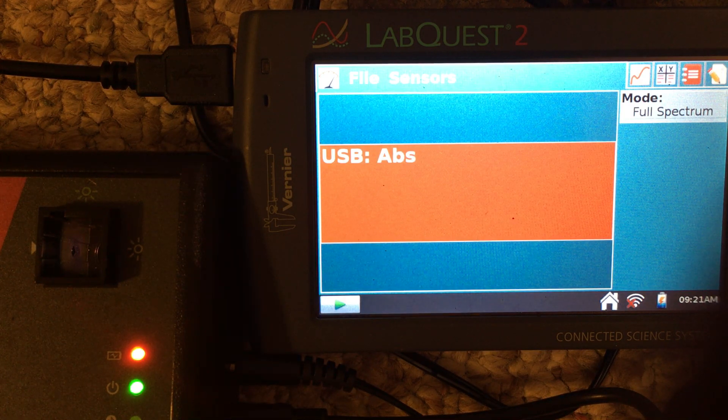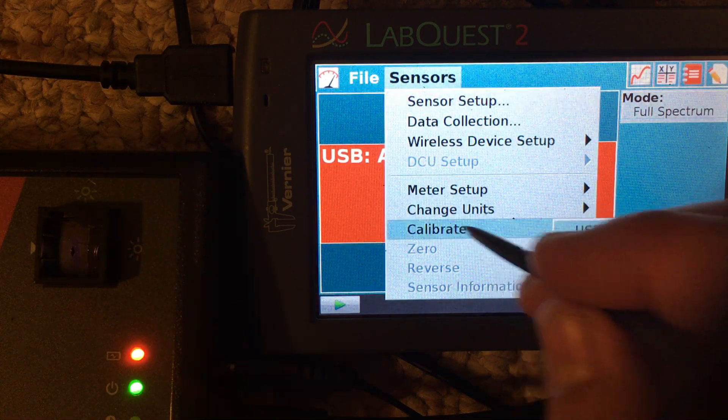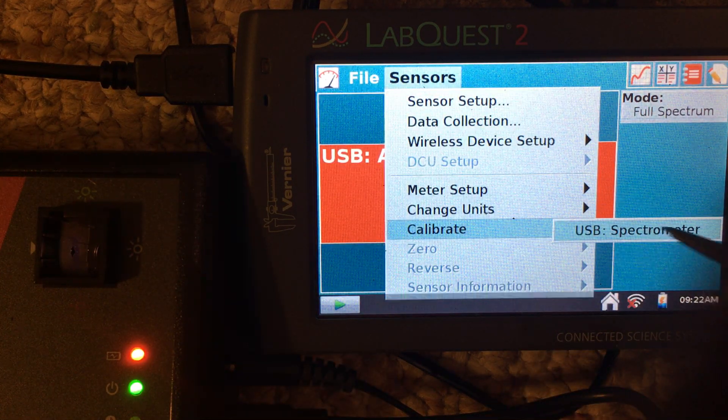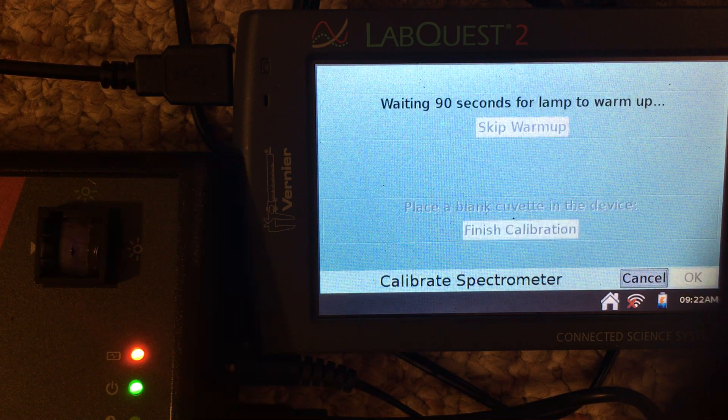In the sensors menu, go to calibrate spectrometer, and then take the dark sample. It takes some time for the lamp to warm up to acquire a sample with no cuvette in the spectrometer.